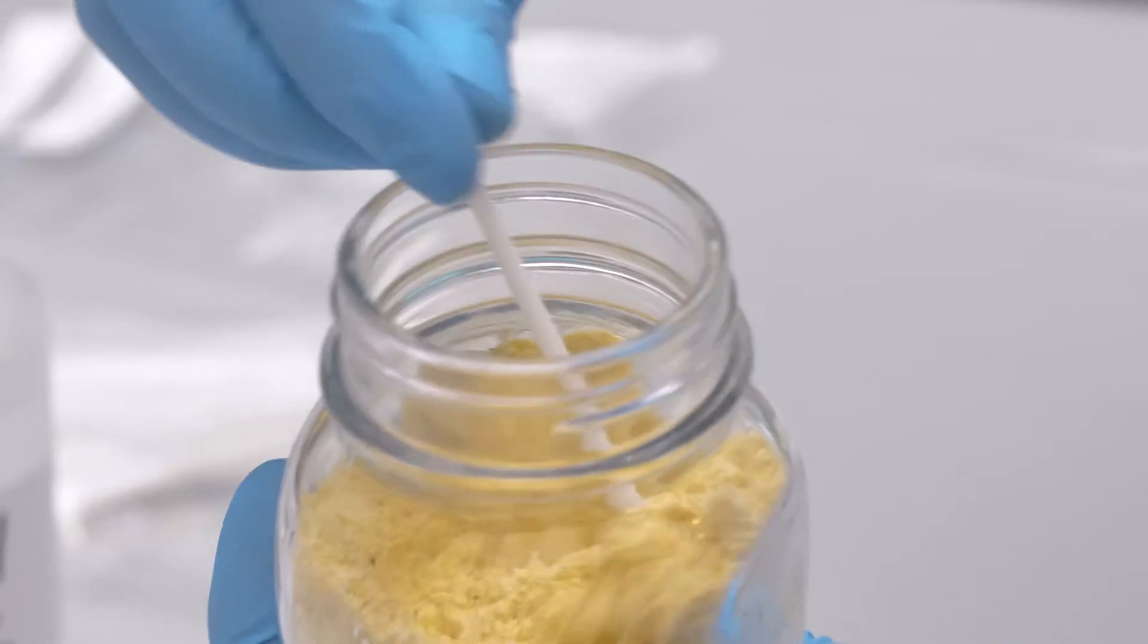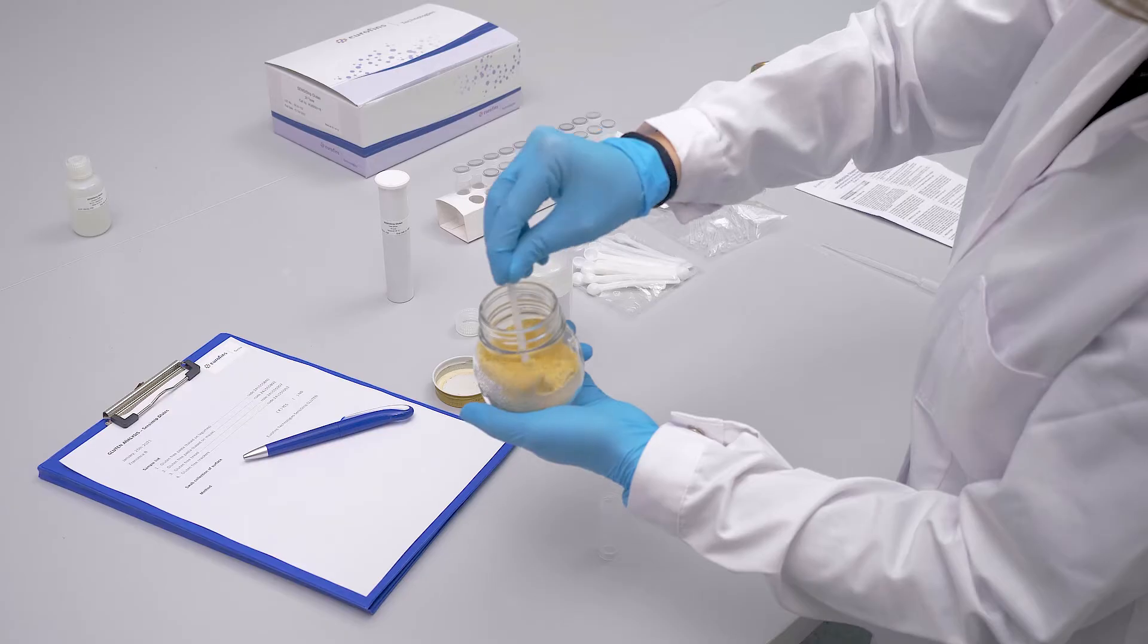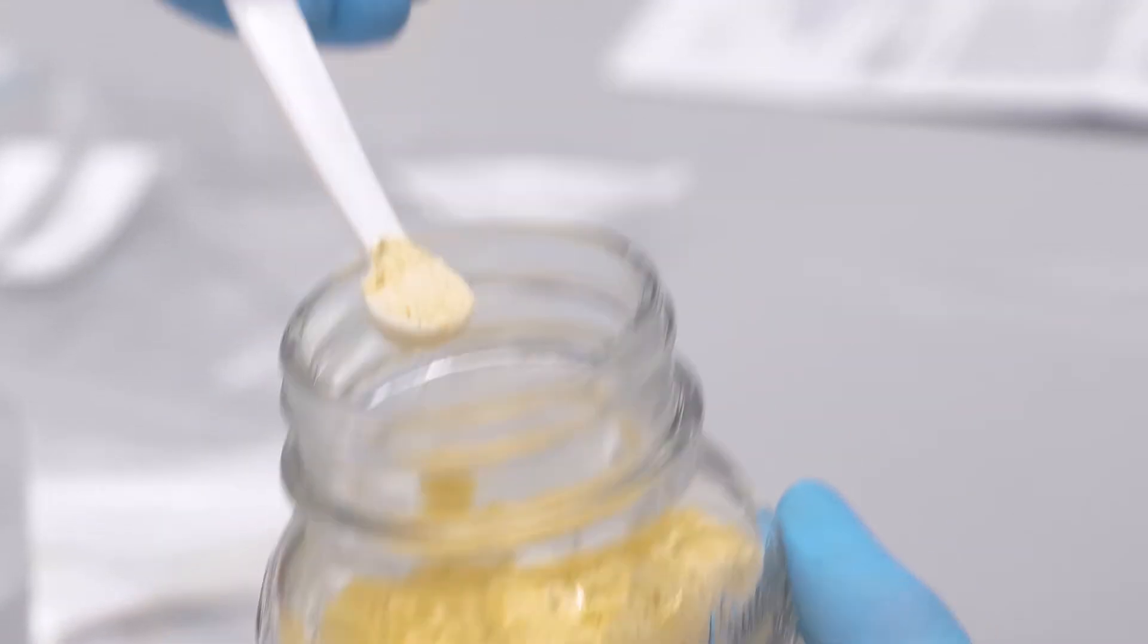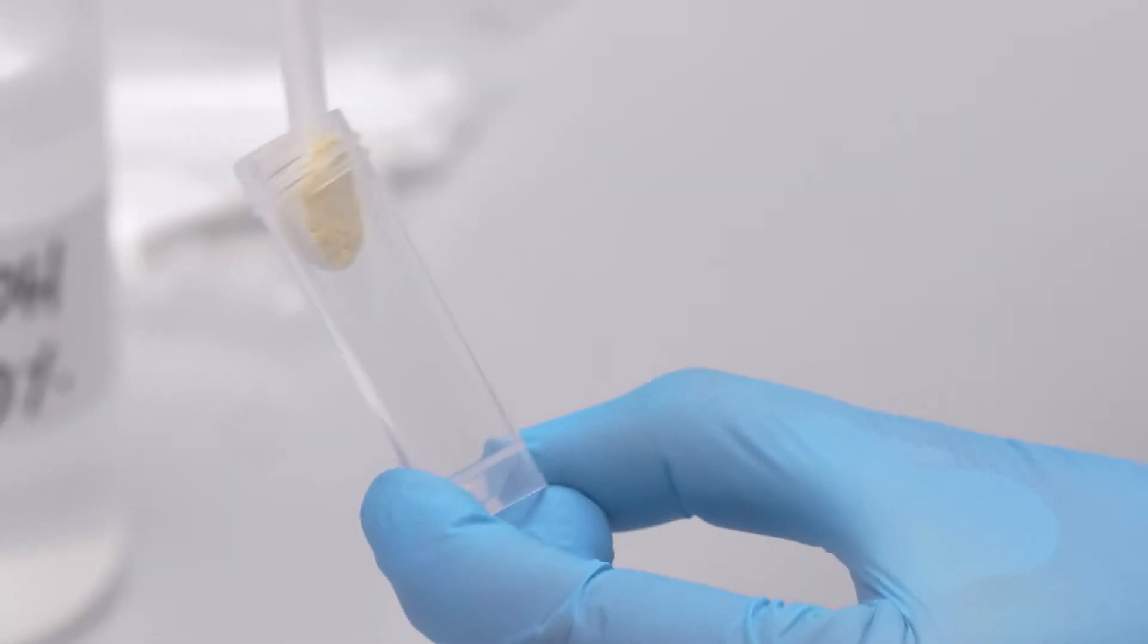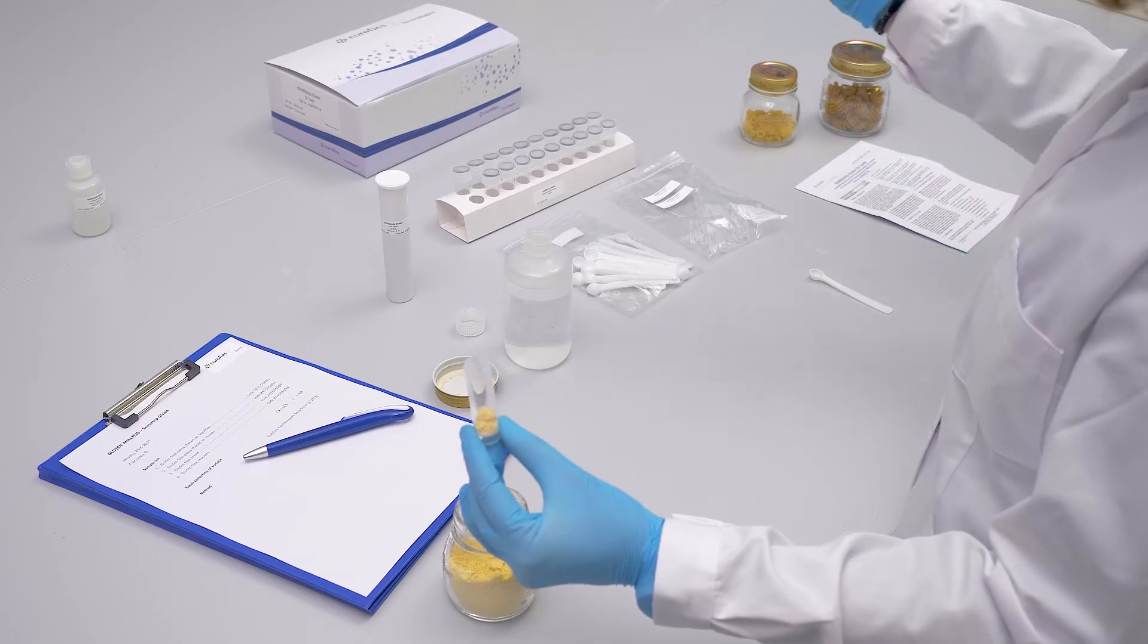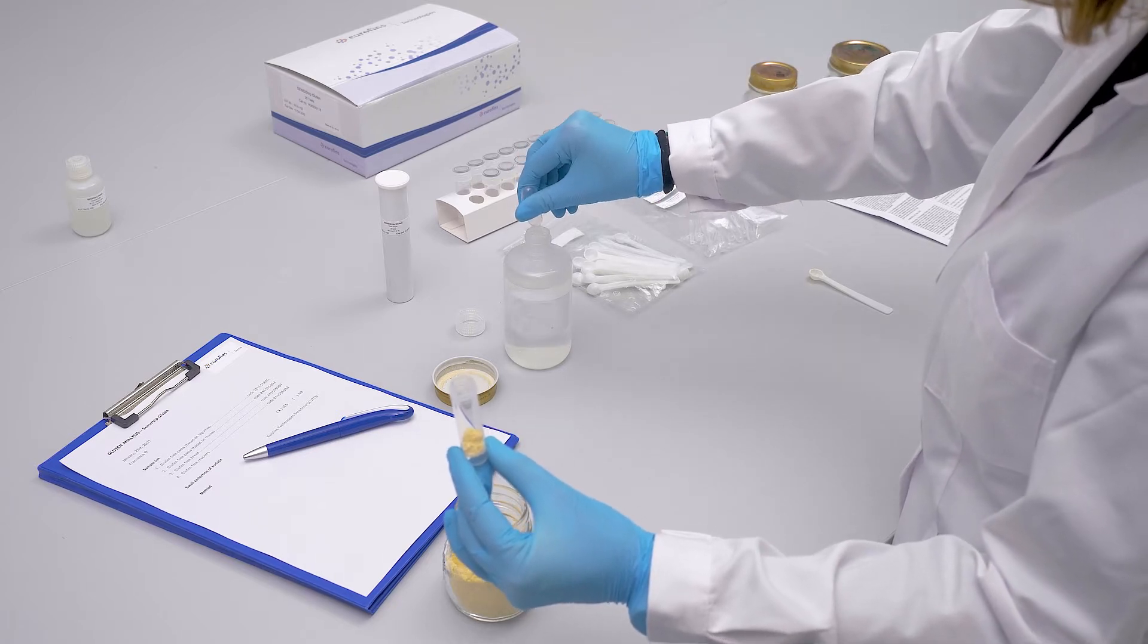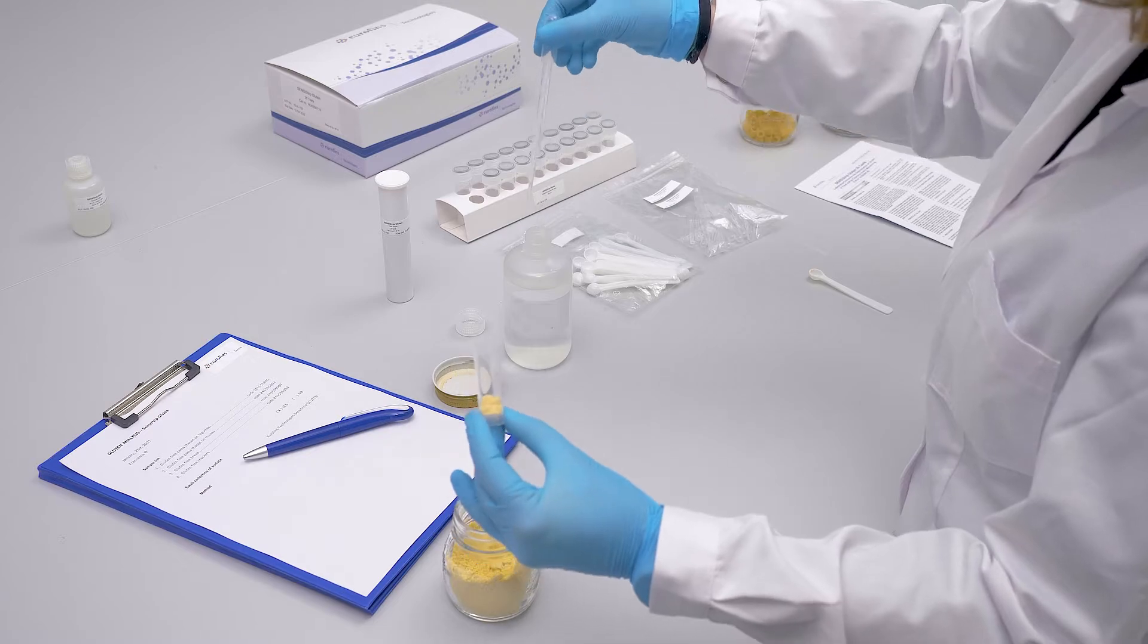For food samples analysis, it is needed to grind the sample properly and collect a quantity of about 300 milligrams and transfer it in the extraction tube. Dilute the sample adding 3 milliliters of ethanol water solution using one of the pipettes provided in the kit and shake for one minute.